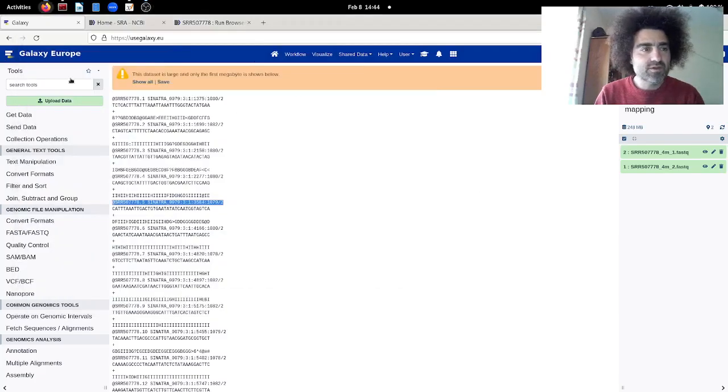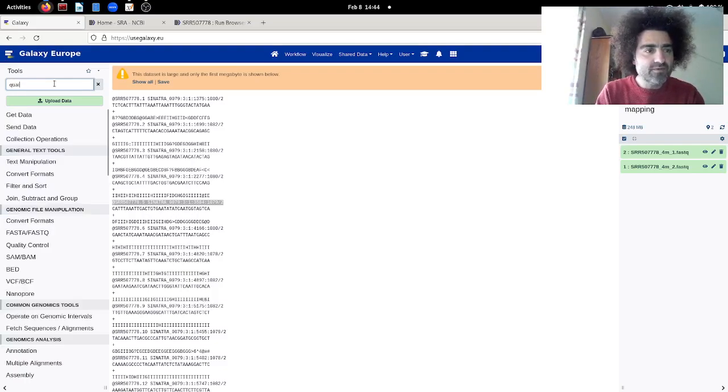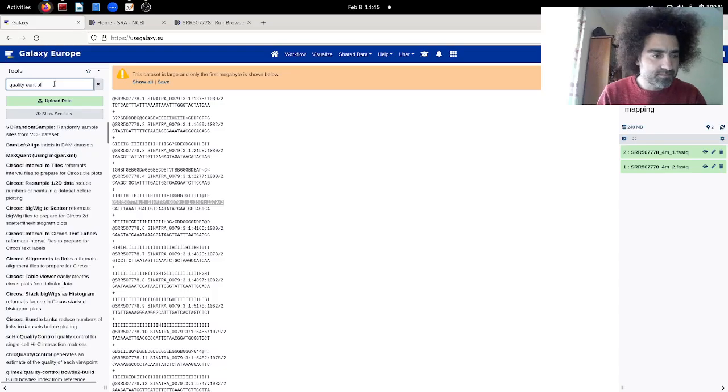Now the next step is to go for the quality control checks. Okay, so I will just type here fastqc. It's a standard tool that we use for quality control. Unfortunately, it doesn't help if I type here quality control, because as you will see, I don't find anywhere here the fastqc.